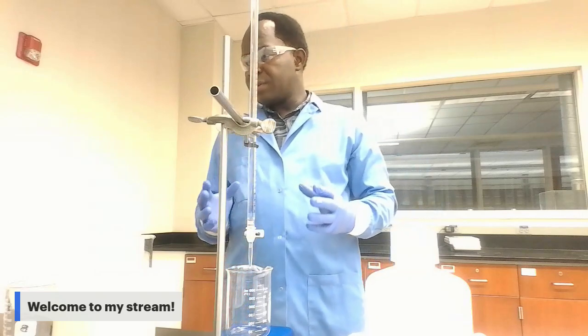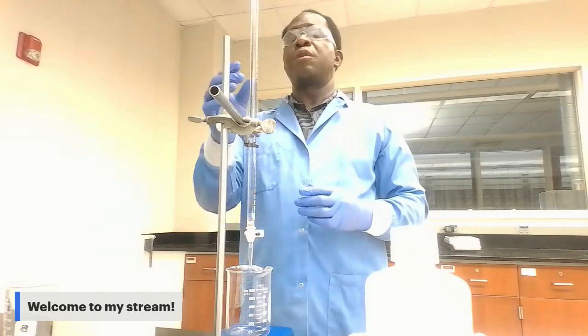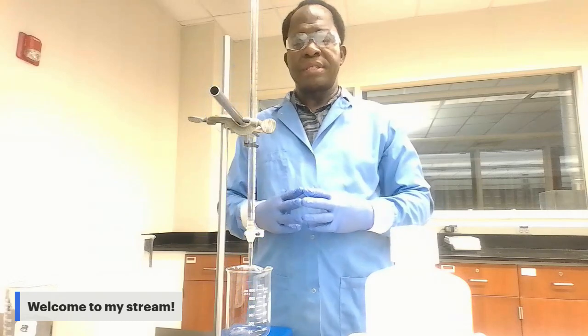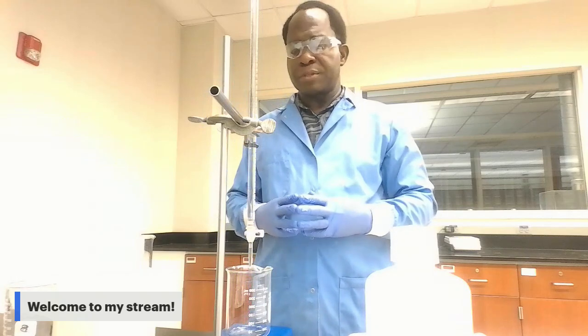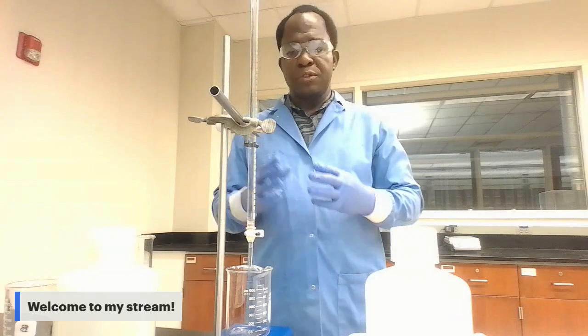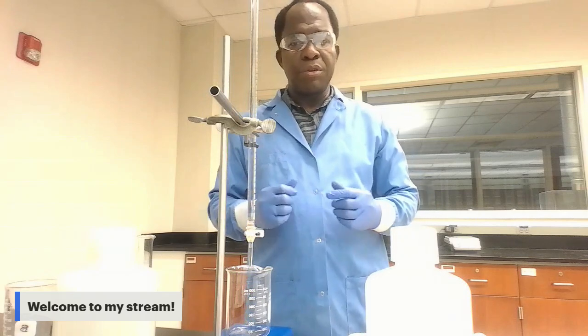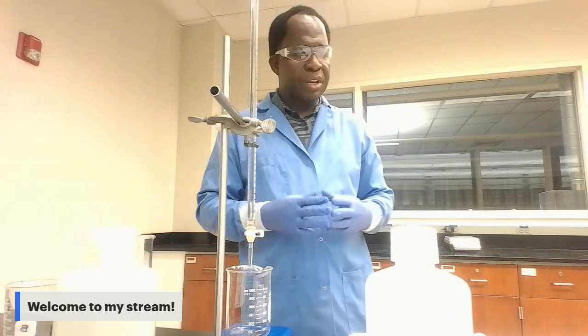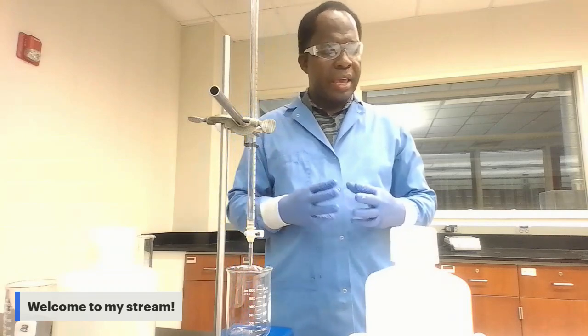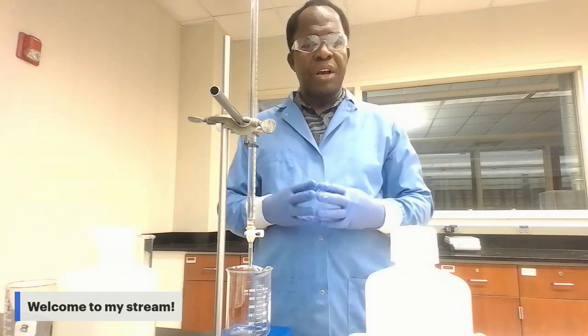We are going to titrate the solution with hydrochloric acid, and the results of this titration will be used to determine the molar solubility and the Ksp of calcium hydroxide.